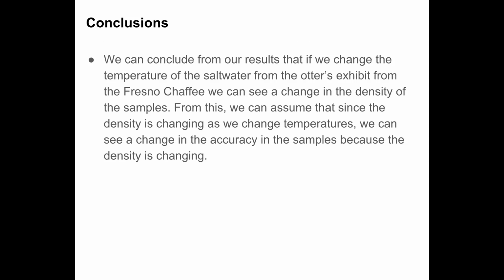And so we conclude from our results that if we change the temperature of the salt water from the otter exhibit at the Fresno Chaffee Zoo, we can see a change in the density of the samples. From this observation we can assume that the density is changing as we change temperatures. We can see a change in the accuracy of the hydrometer because the density is changing and it's not constant.